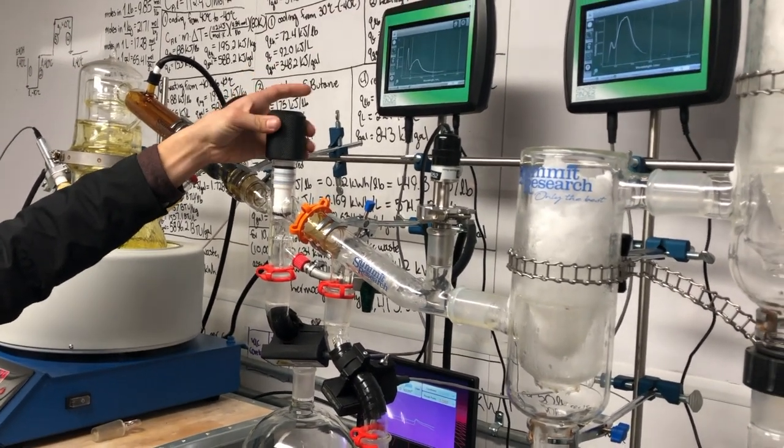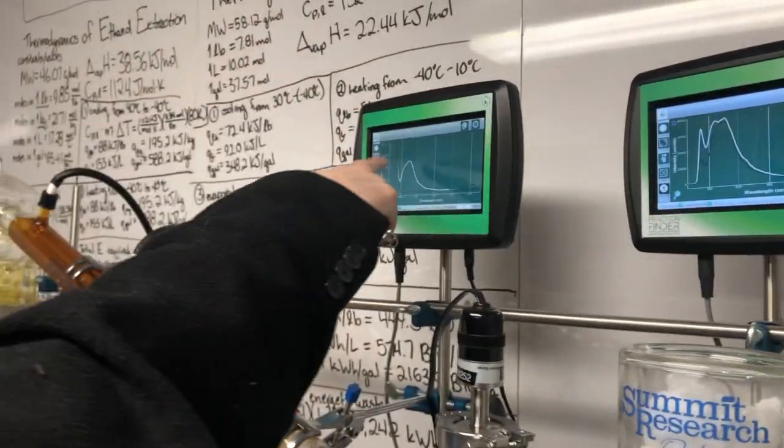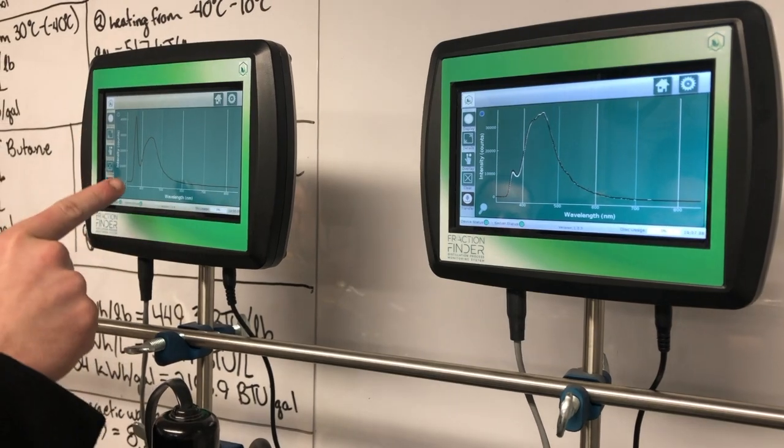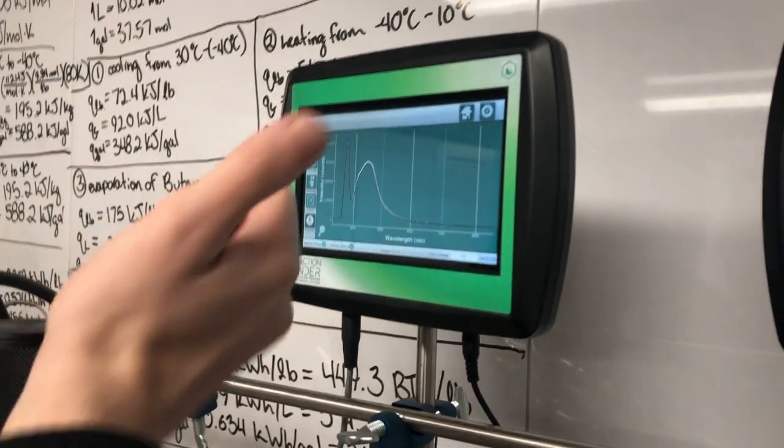Yeah, you get a nice cannabinoid peak on the left though. We're getting a nice 460 peak, which is what we want to see. And we're seeing basically no 410 on this side. This should be constant until we get to our tails. But once you get to your tails, you're going to see that peak, 460, start moving toward 500.